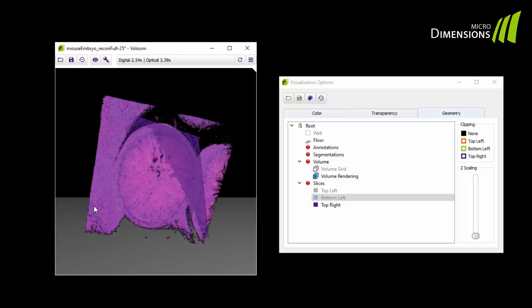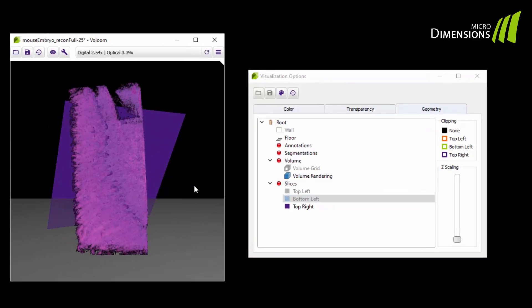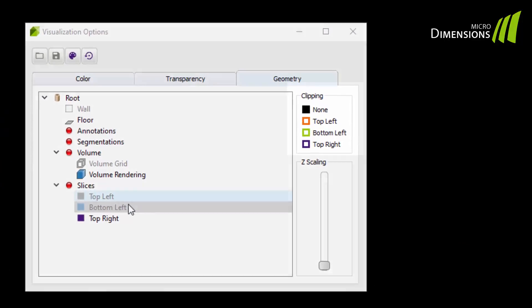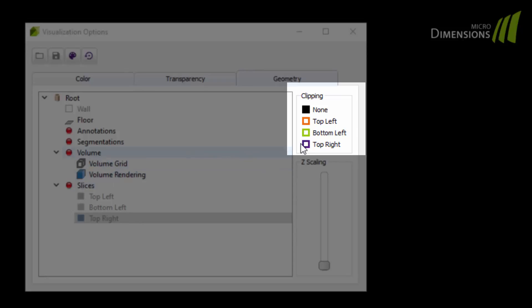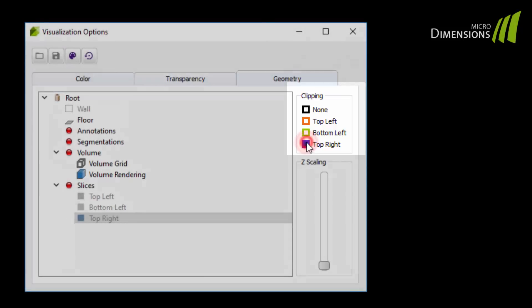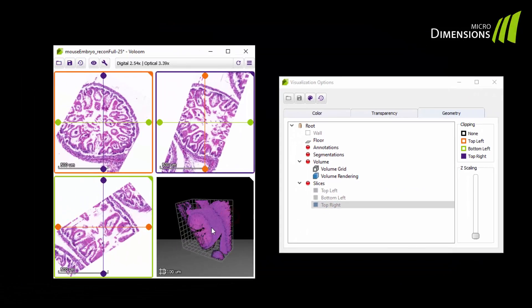Now turn your attention to the clipping option in the upper right part of the geometry tab. With the clipping option you can create clipping planes corresponding to the virtual cutting planes. Tick the option top right to clip the volume at the position of the purple plane.